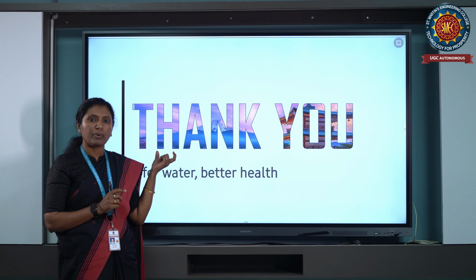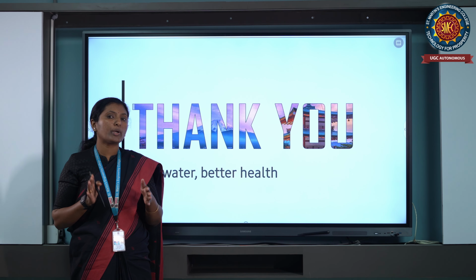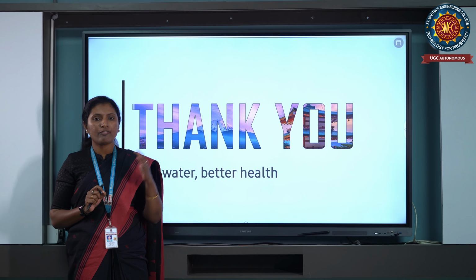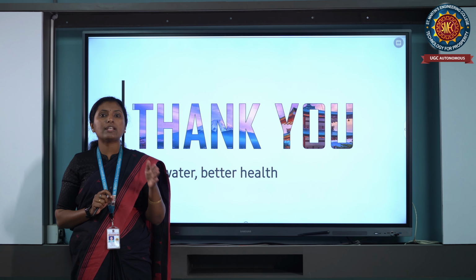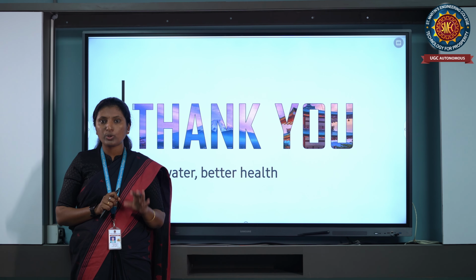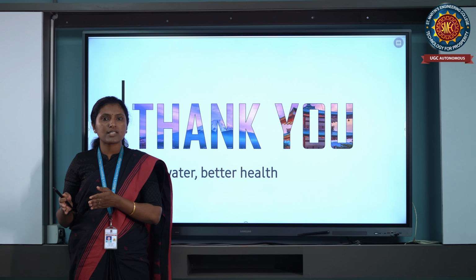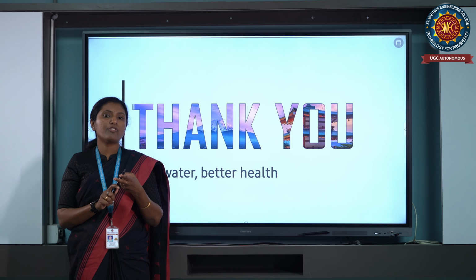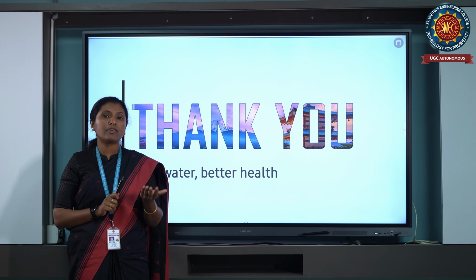Each solution you keep, and for each solution you will get the EMF. After getting the EMF, what are you doing? You are plotting a graph. What is on the x-axis? Log of concentration of fluorine. Y-axis, EMF. Then you will get a straight line. What is the equation for a straight line? y = mx + c. From there, the equation for the EMF is EMF = S log[F-] + constant. The constant means the intercept, and S means the slope. So if you know the EMF, the slope, and the intercept, we can find the concentration of the unknown solution.